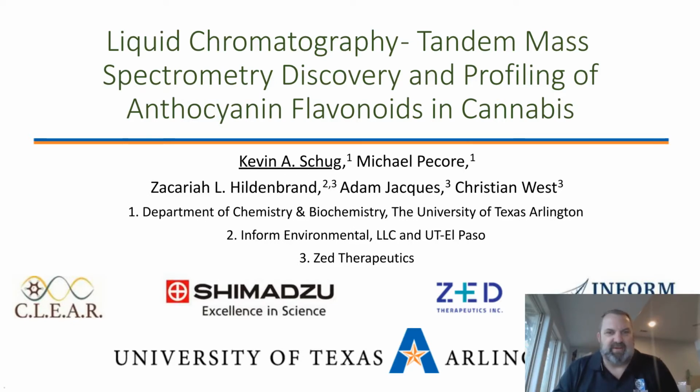I'm very excited to be here today to tell you a little bit about the research we've been doing on hemp, low THC cannabis, specifically in this case using liquid chromatography and tandem mass spectrometry to look at anthocyanin flavonoids, those molecules that give the plants the various different colors, and how those vary between different cannabis cultivars.